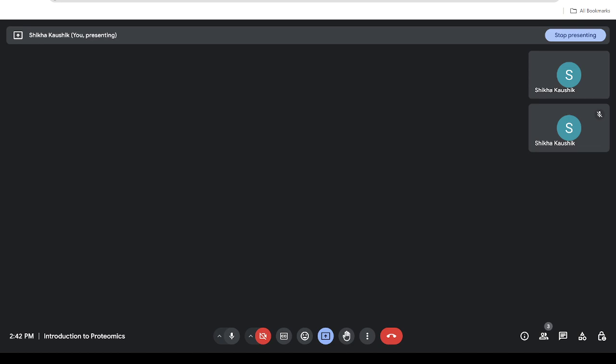Right now we talked about volume. Then we have a time. It is obtained by dividing the dwell volume by flow rate.